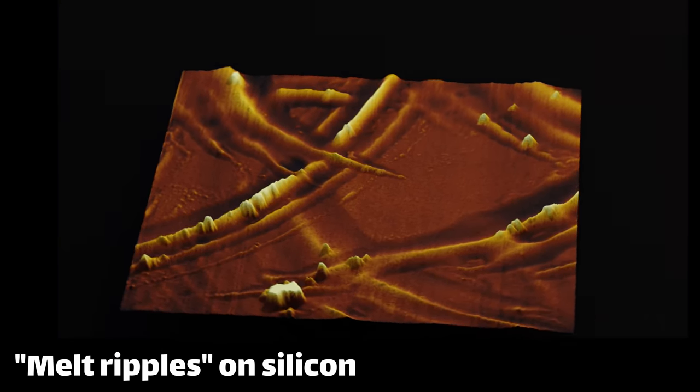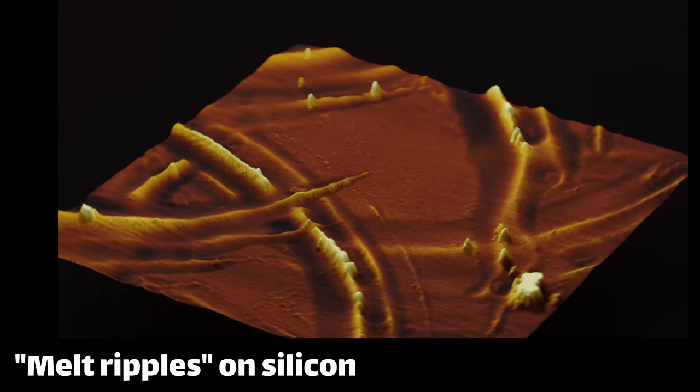This is something that I've been interested in for at least a couple years now, and in fact the very first thing I scanned with the atomic force microscope was one of my earlier experiments with laser doping.